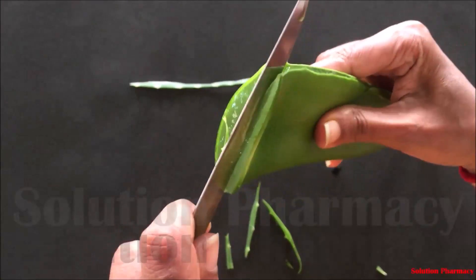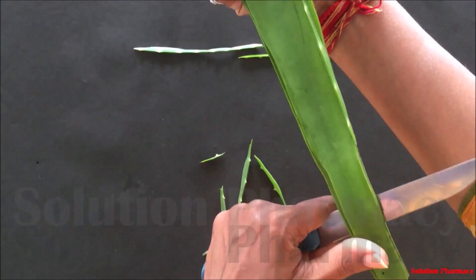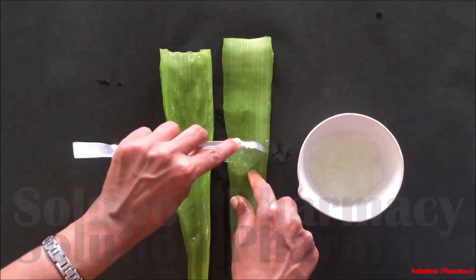After complete removal of the yellow liquid, wash the leaf with water properly and dry it with a clean cotton cloth. Then cut the leaf in such a way so that it divides into two equal parts, as you can see in the video, so that it will be easy for us to remove the pulp.